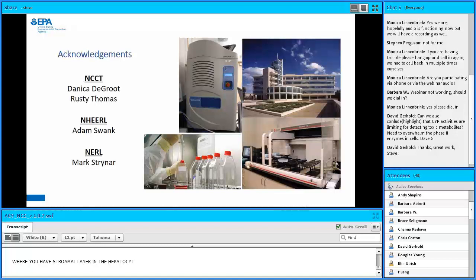So to me, I think those are definitely the most appropriate models to look at chemicals in a lower throughput fashion. The question I think that we're trying to address is a little bit different, and that is, how do we go about screening 5,000 or 10,000 chemicals and trying to identify the ones with potential liabilities? And then I wouldn't actually use the models that we're building here to characterize what's physiologically relevant.